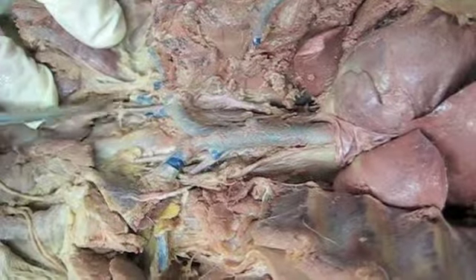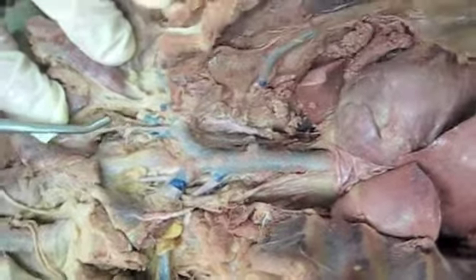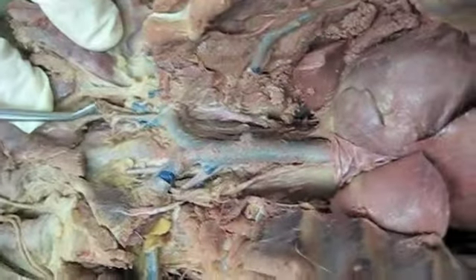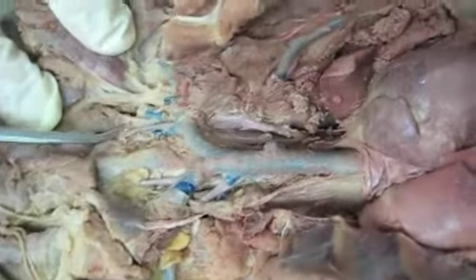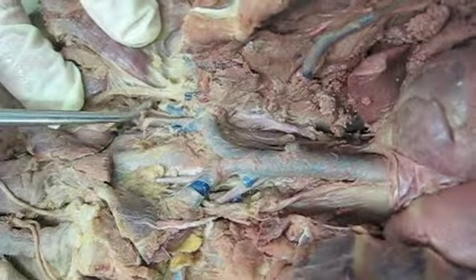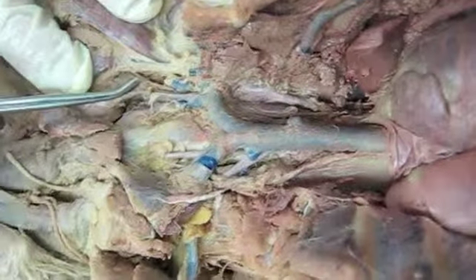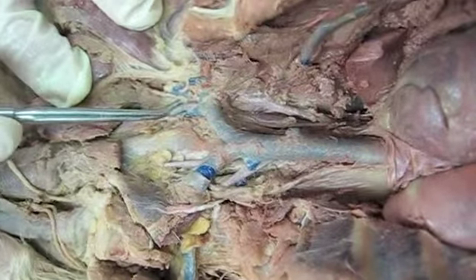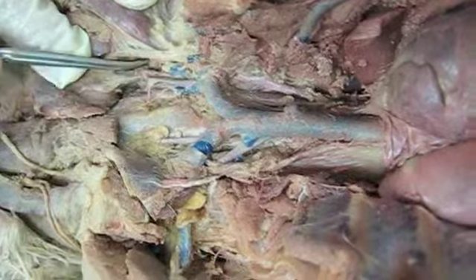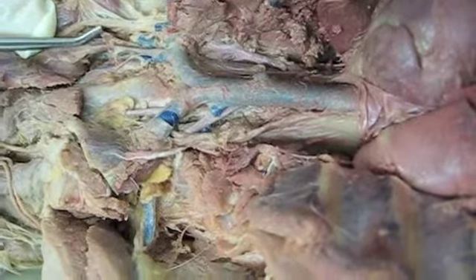But when that thyrocervical artery comes out here and begins to bend deep down into the shoulder, it's paralleling this vein right here that's not very well injected. This was the transverse scapular vein, and so that artery, the thyrocervical, when it bends deep into the shoulder, becomes the transverse scapular artery. So up in here it would be thyrocervical. When it goes down into the shoulder and parallels this vein, they would both be transverse scapular.